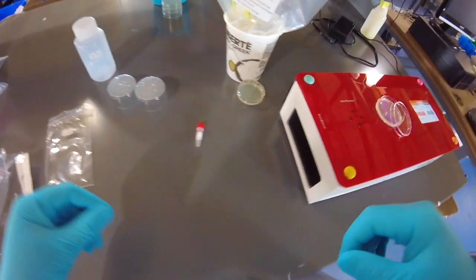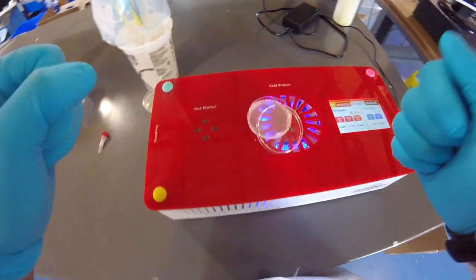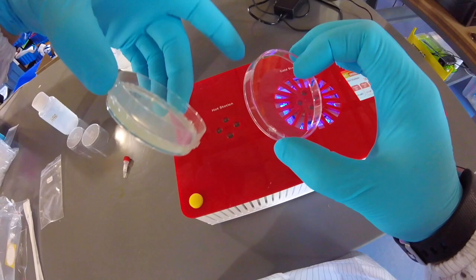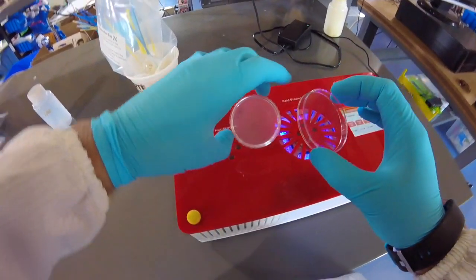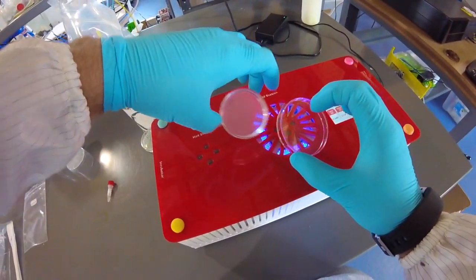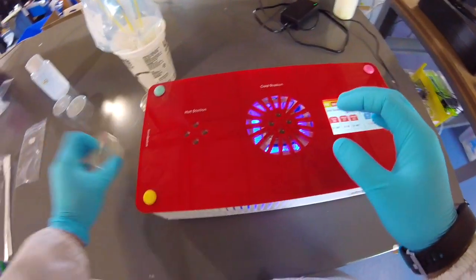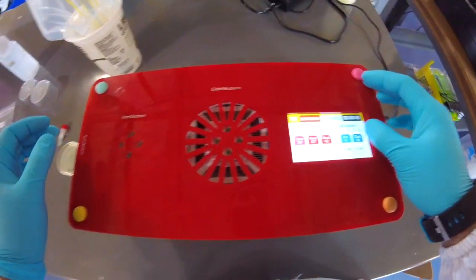All right, so I'm back. It's been about 5 to 10 minutes. It's kind of dry in the environment I'm in right now, so it's evaporating pretty fast. If you tip it around, you don't really see much cells moving around. Virtually no liquid. So now you're in a good place, if yours looks like this, to flip it upside down. Put the lid on and flip it upside down. I'm going to turn this off.